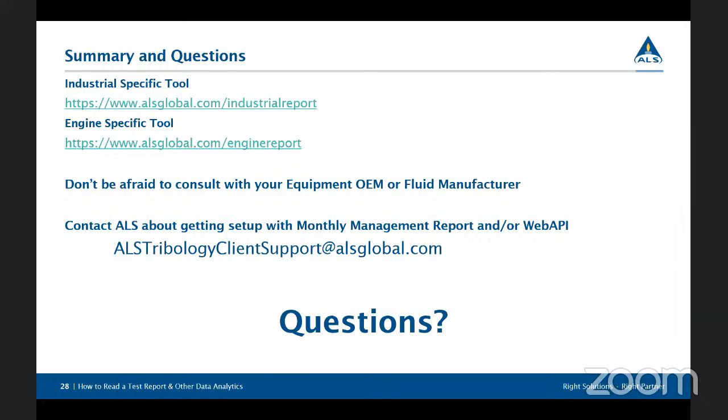Jerome, it's not a huge deal if you absolutely have no way to know. It's totally fine, just submit the sample. We're going to do our best to interpret it. Obviously, if the wear level is considered high in general, we're going to go ahead and let you know. I'm assuming if you don't know how many hours are on it, possibly it's been in use for a long time.